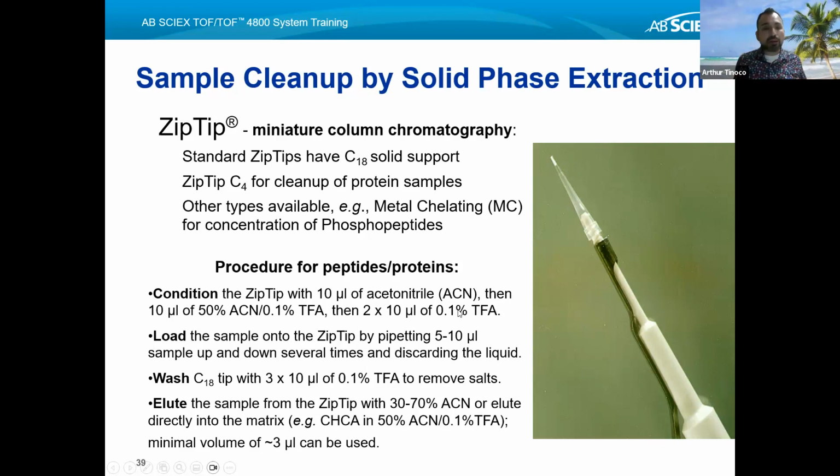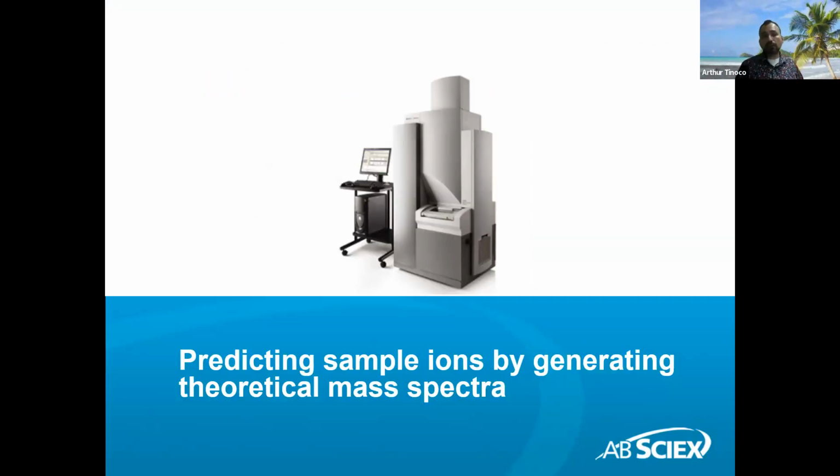So here's a protocol. I'm not going to go through it because this is a standard protocol you can find online, or you can find it accompanying the pack of tips that come from the company. But I provide it to you so that in your spare time, you can read this slide much more carefully. The point is that there are ways to clean up a sample if you need to run that sample with the MALDI, and you need to do so right away. All right, so that concludes the discussion of sample prep.